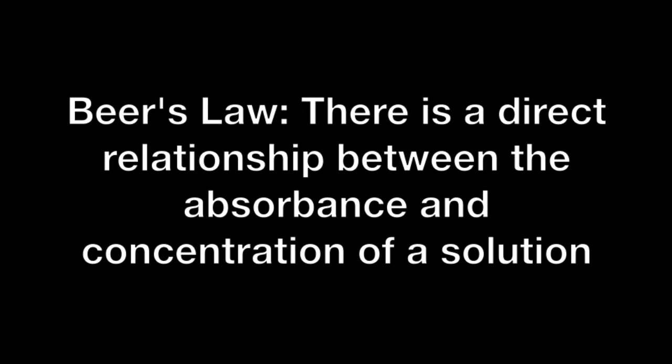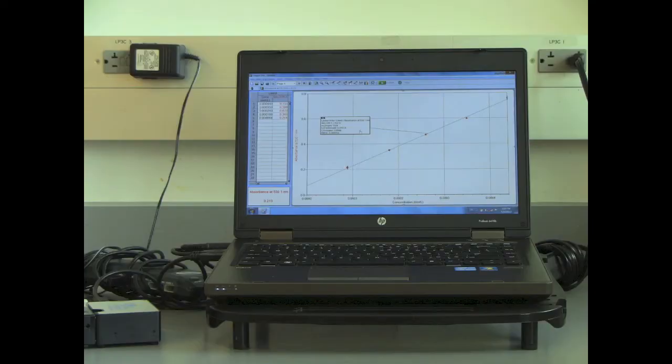For this experiment, a spectrometer will be the instrument used to find the concentration of different solutions. In this experiment, you will use the spectrometer to measure the absorbance of solutions that you know the concentration of the complex ion in. From those absorbances and the known concentrations, you will make a standard curve which you can use to help identify the concentration of an unknown solution. That will be week 2 of the procedure.